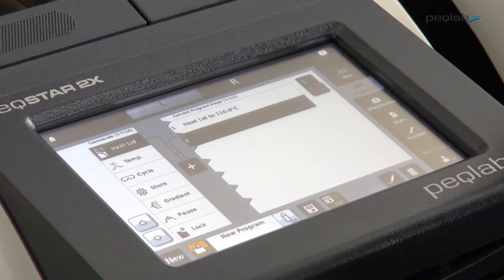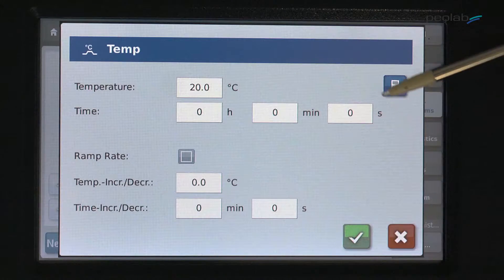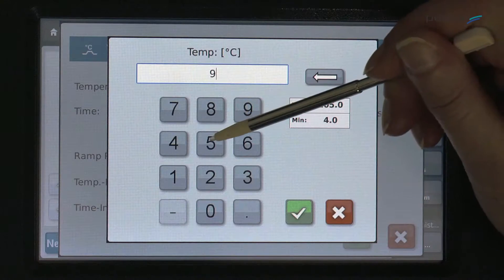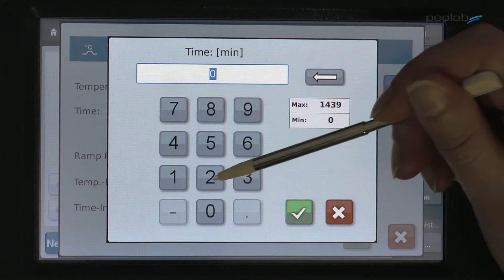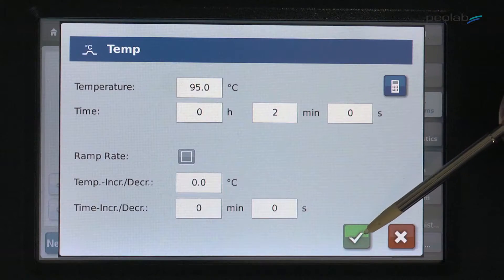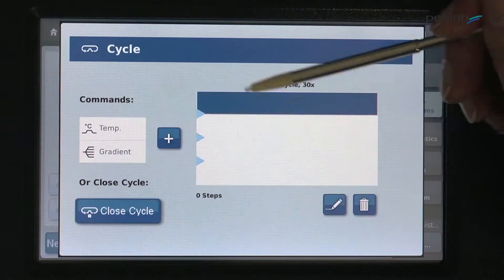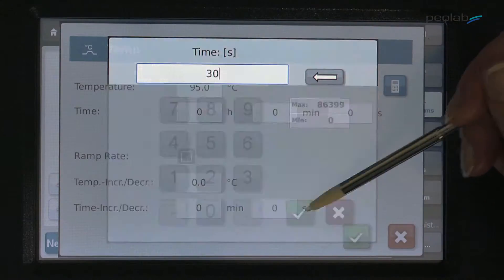To create a PCR program, select a command and add it to the script. The software leads you through the operation, giving you the option to add advanced routines such as gradients, touchdown, or long-range PCR.